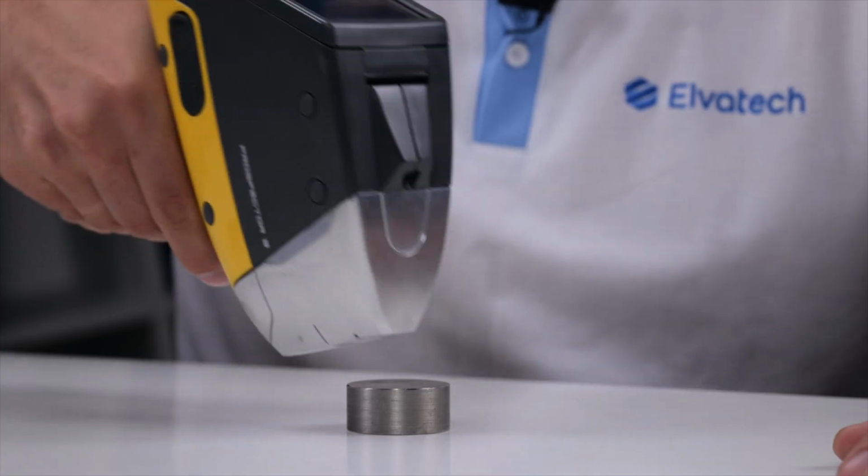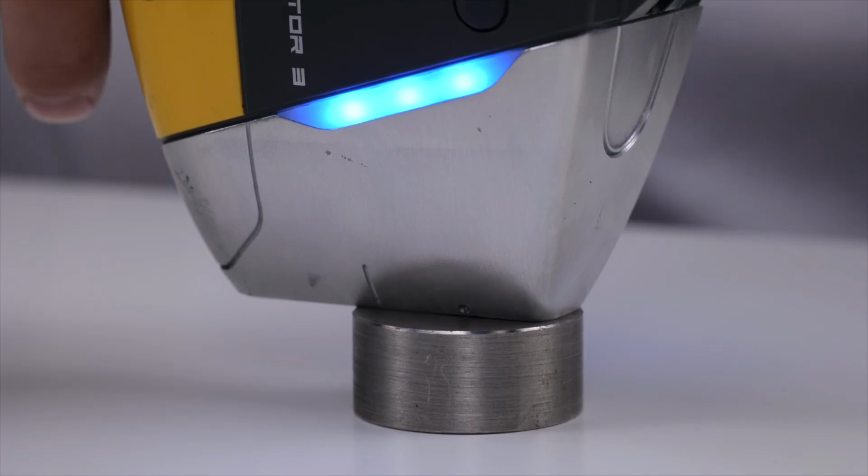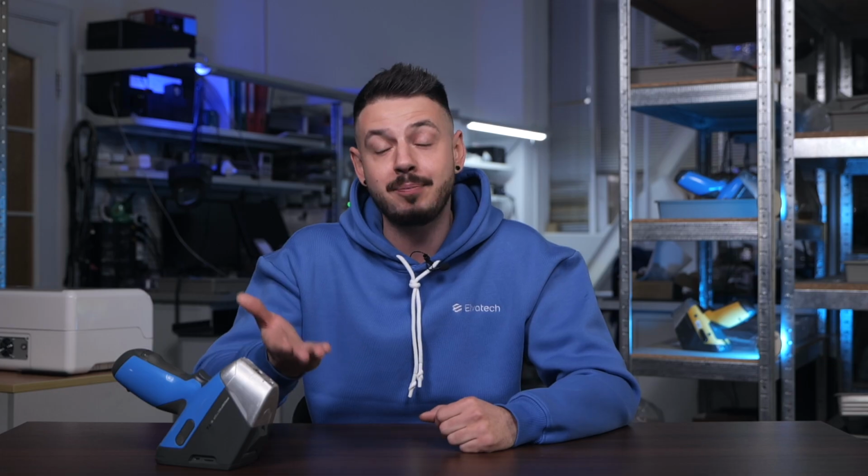Another effective approach is to measure multiple points on the sample and average the result. This is especially helpful for materials with an uneven surface or complex composition. Take stainless steel, for example. To accurately measure chromium and nickel content, you need to account for how they influence the signals of iron. Without this adjustment, your result might be misleading.